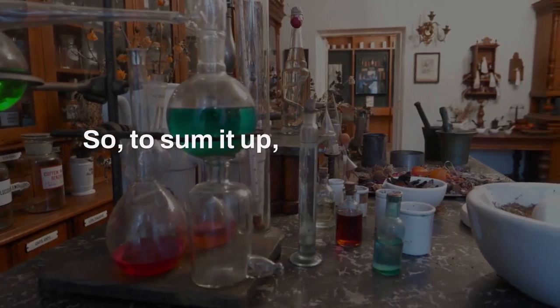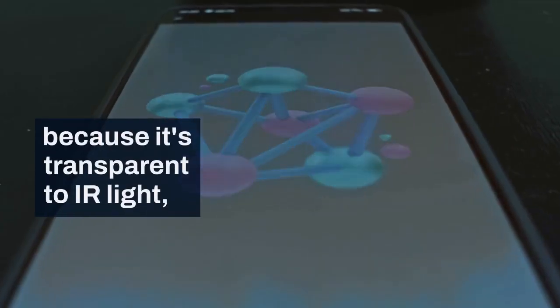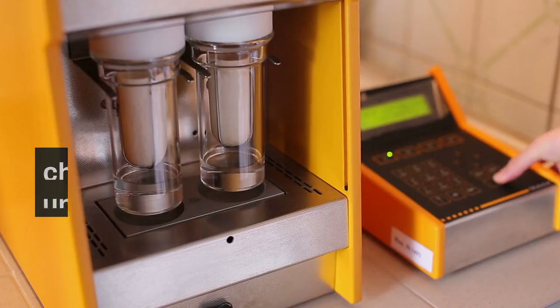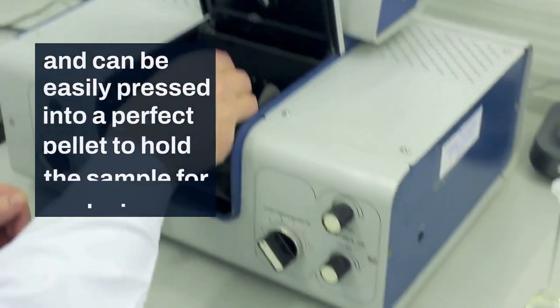So, to sum it up, KBr is the go-to material for solid-state FTIR because it's transparent to IR light, chemically unreactive, and can be easily pressed into a perfect pellet to hold the sample for analysis.